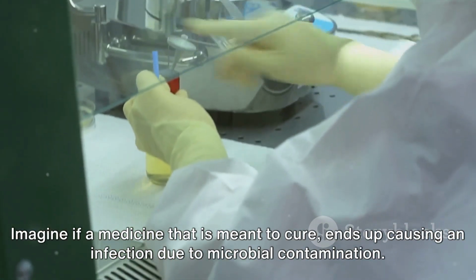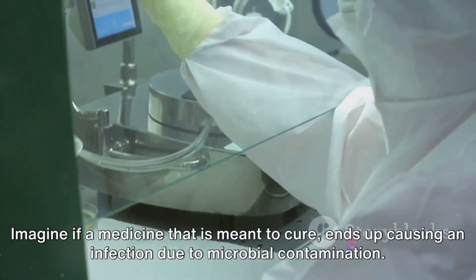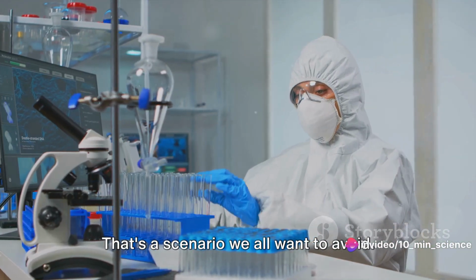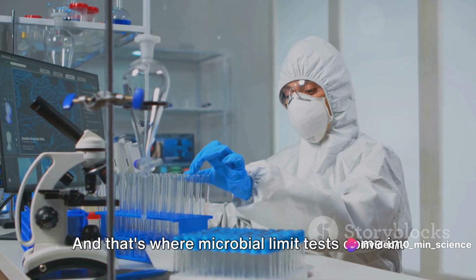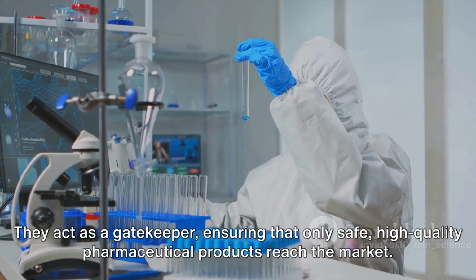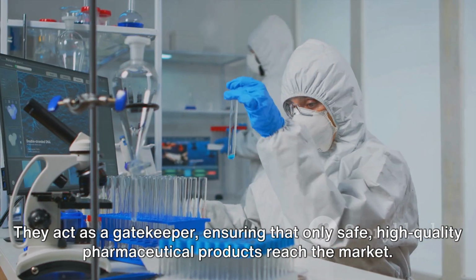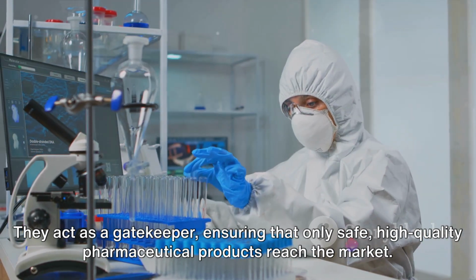Imagine if a medicine that is meant to cure ends up causing an infection due to microbial contamination. That's a scenario we all want to avoid, and that's where microbial limit tests come in. They act as a gatekeeper, ensuring that only safe, high-quality pharmaceutical products reach the market.